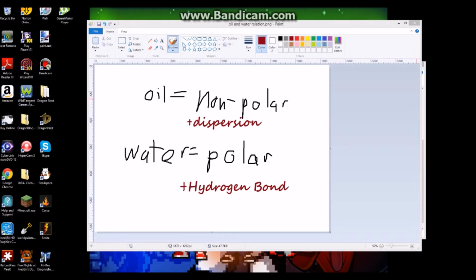Now the oil is non-polar because when the 2 were mixed onto the penny, it didn't dissolve, and that's because of something called like dissolves like. Like dissolves like is when a polar substance dissolves in another polar substance. The same goes with non-polar substances. And in this case, the oil did not dissolve in the water, so it would be non-polar, and the intermolecular force would be dispersion because every molecule has dispersion forces, polar or non-polar.